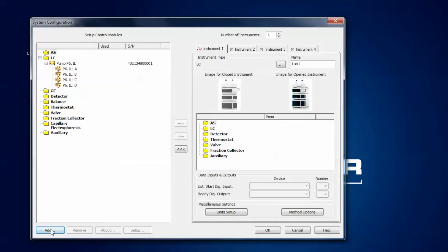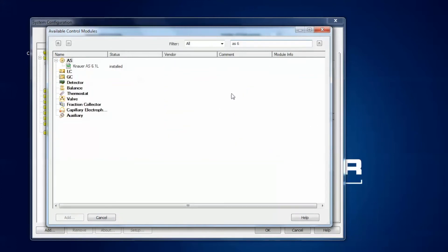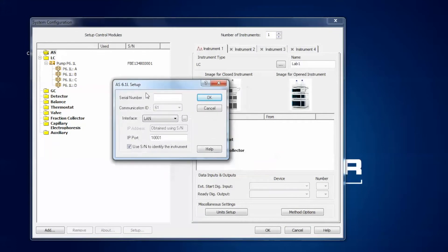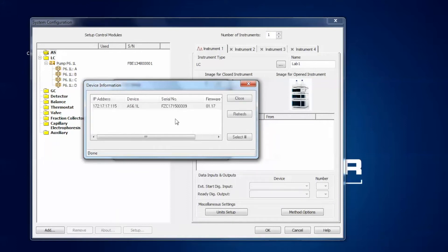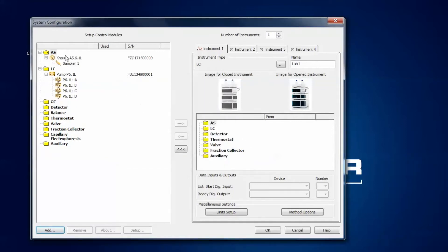Next we will add the auto sampler. Go to the add button again, type in AS6.1L, and the list shrinks down to one item. You can press the add button or just double-click. The setup window pops up and in this case there is much less to configure — you can type in the serial number, but it is easier to use LAN auto-configuration. The software searches for available devices and once finished you can press select or double-click. The serial number is automatically transferred and since there are no further configuration options, click OK. The auto sampler is now added alongside the pump.